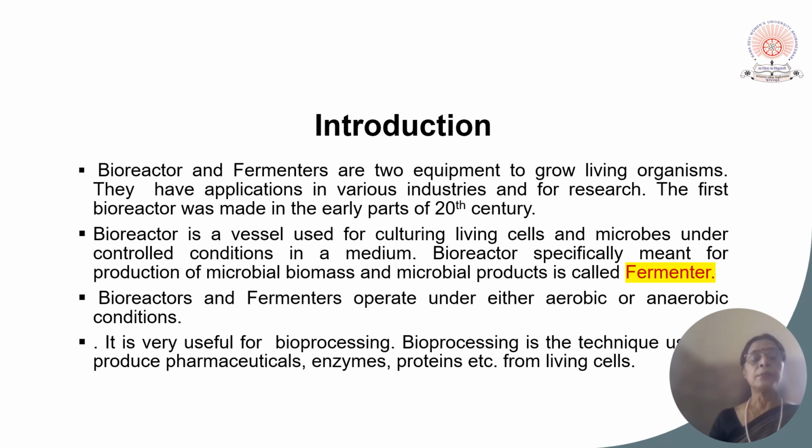The difference is that fermenters are used mostly for the production of microbial biomass and microbial products, and a bioreactor is used for the culturing of any type of living cell, may it be an animal cell, plant cell, or a microbial cell. And there is a process, bioprocessing. It is a technique for the production of industrial pharmaceutical enzymes and proteins from living cells, and bioprocessing is done inside a bioreactor or fermenter.